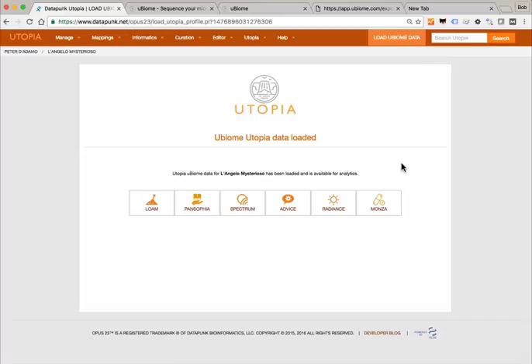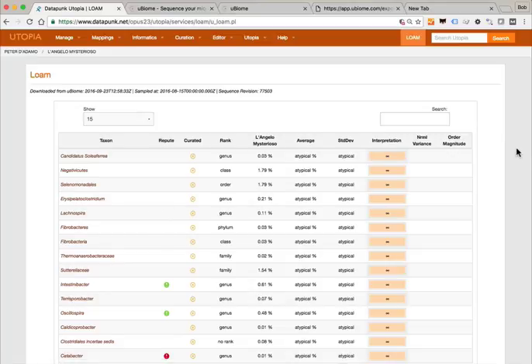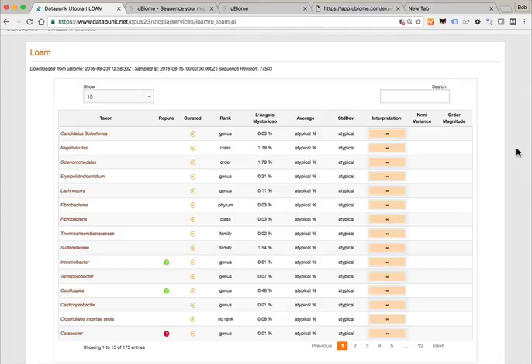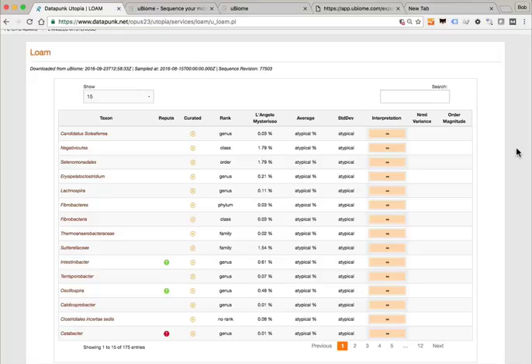The equivalent in utopia of the Opus Argonaut app is an app called Loam. Just like most people start in Opus 23 by firing up Argonaut to look for SNPs, in utopia you go to Loam. Loam looks surprisingly like Argonaut — it has a depiction of all the various taxons reported in the uBiome report. With bugs it's different than genes: genes you either have a C or a T, it's straightforward. With microbiome data it's more difficult because people have significant variation that's part of a normal situation.